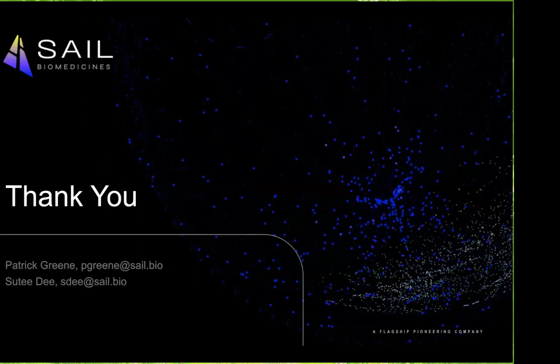So the question was how much RNA/DNA are we handling? And to clarify, we don't often make too much of a distinction between the two, at least for the data side, because it's essentially the same as far as we're concerned. There are two avenues, as I said. There's the high throughput, which is sort of throwing it all out there and seeing what sticks. And that produces the vast majority of our RNA/DNA sequences.